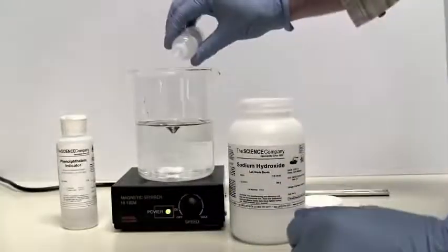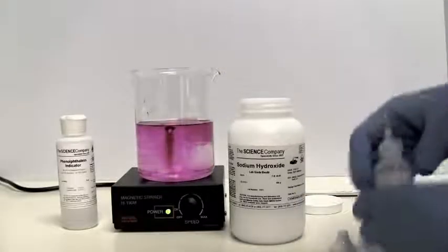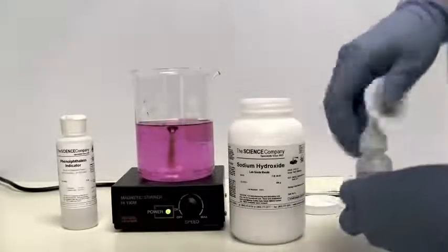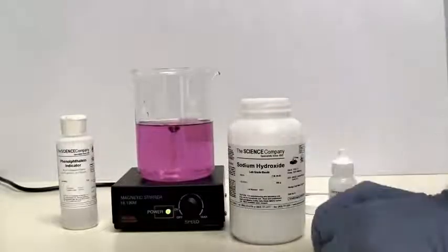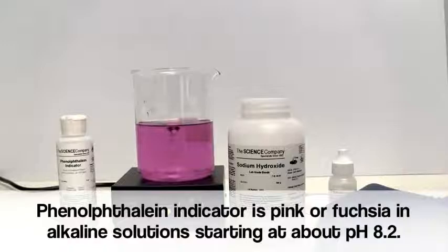When a few drops of phenolphthalein are added, the solution turns a bright pink. This property of phenolphthalein makes it very useful for testing pH in many applications, including soap making, concrete testing, and of course laboratory acid-base titrations.